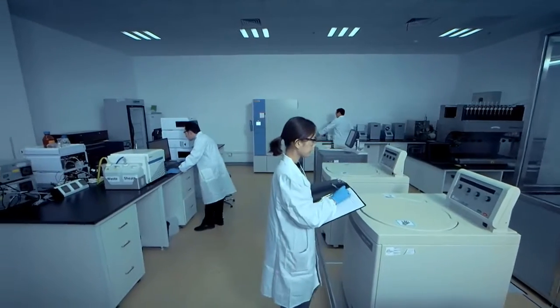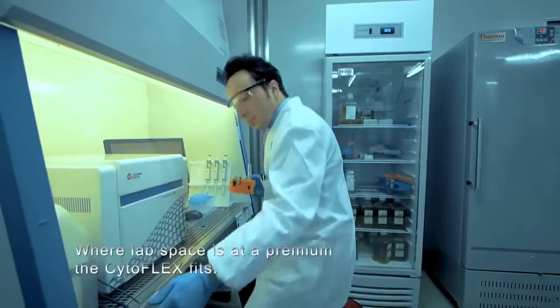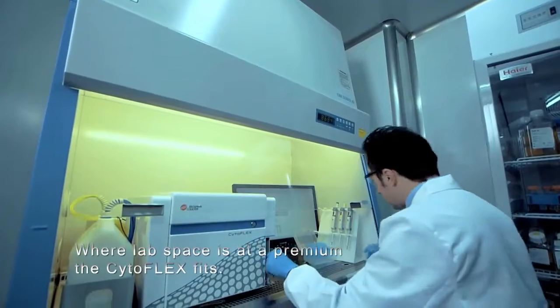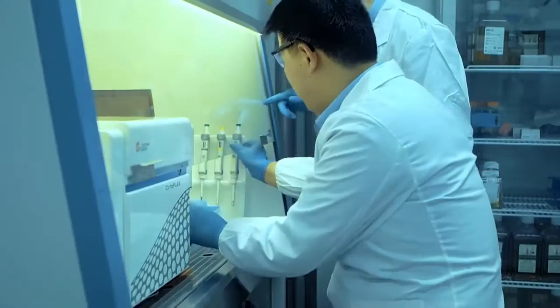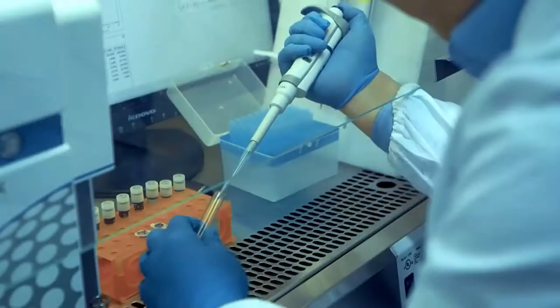So if you thought you didn't have the space in your lab for a research flow cytometer, think again. Thanks to its cutting edge design, CytoFLEX easily fits inside most biosafety cabinets.